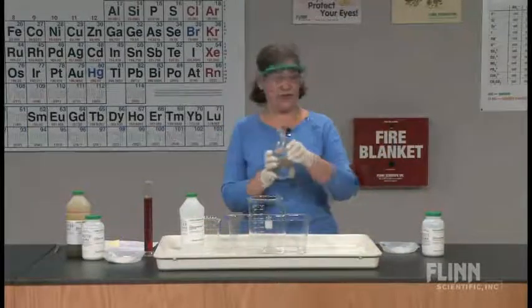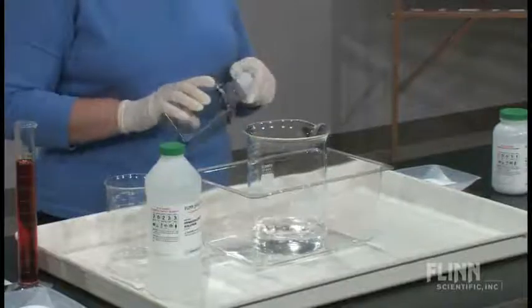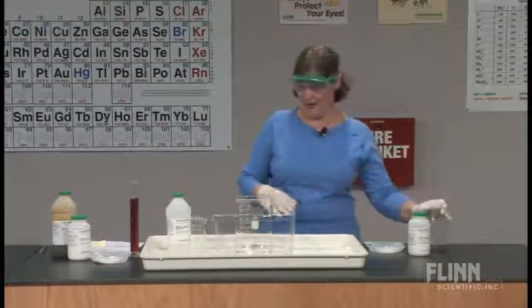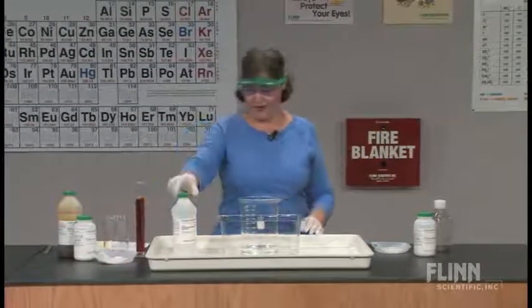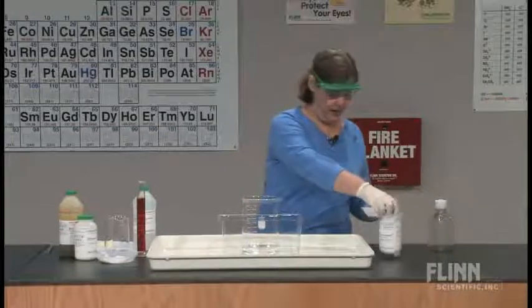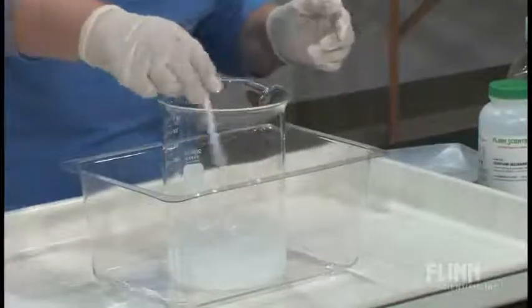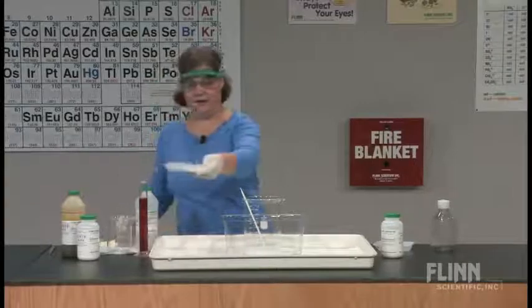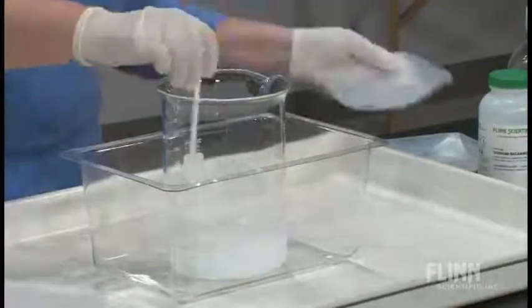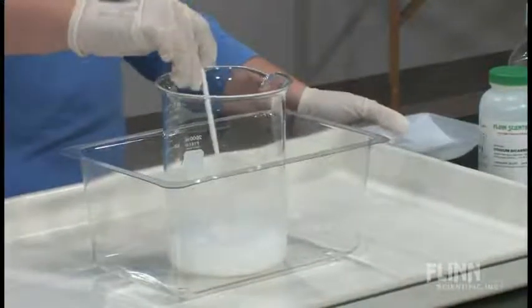This one utilizes very simple chemicals. I have tap water — you can probably judge from the containers assembled here that I'm going to get a little froth, foaming, and overflowing. I've promised not to overflow my containers. I've got about 300 milliliters of tap water, and I'm adding 50 grams of sodium bicarbonate — not all of it will dissolve. I'm also adding some alkanox, which is simply a solid detergent, about 50 grams of that as well.